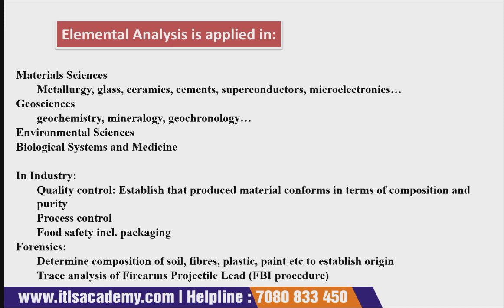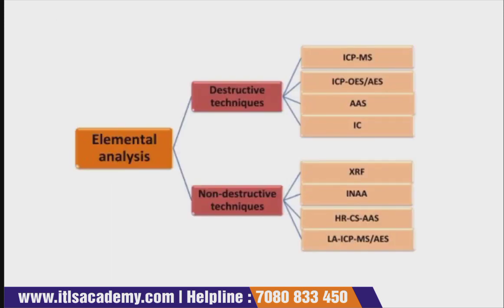to establish the origin. Because we all know that the soil or the paint or anything that is there at the crime scene acts as evidence. So in determining the evidence, this elemental analysis plays a very important role. Okay, so these are the applications of elemental analysis.